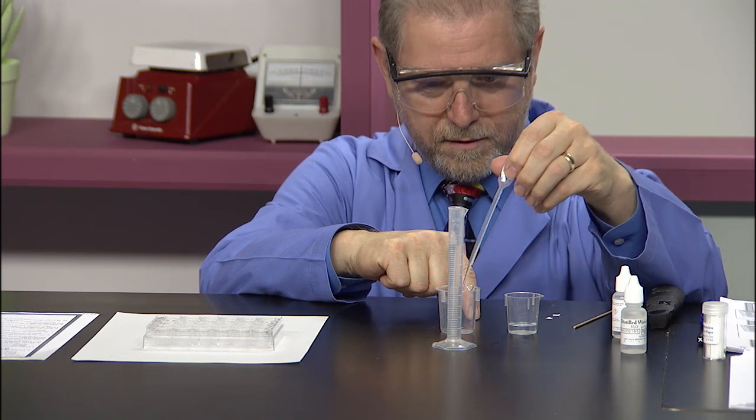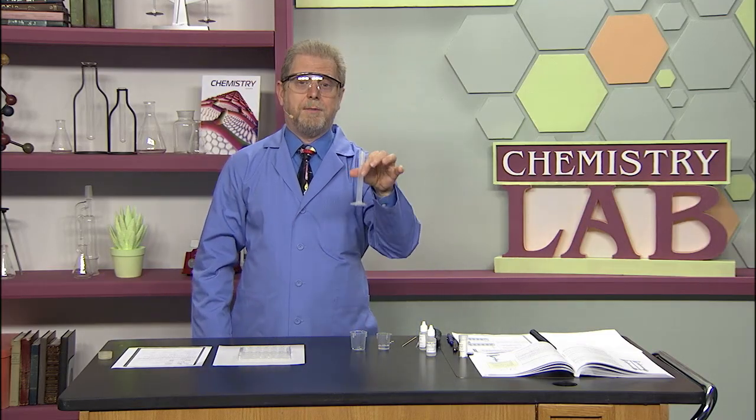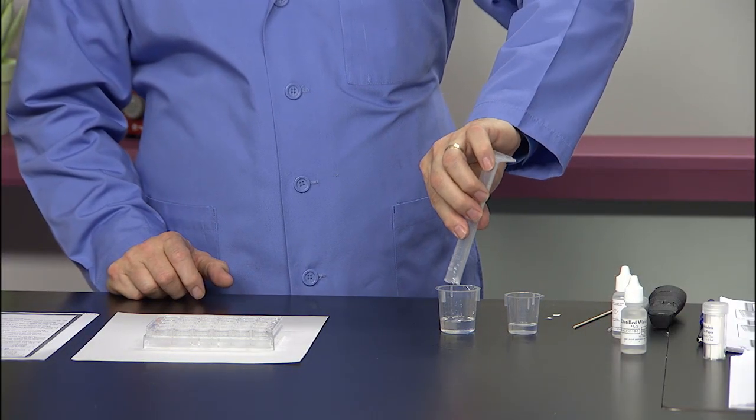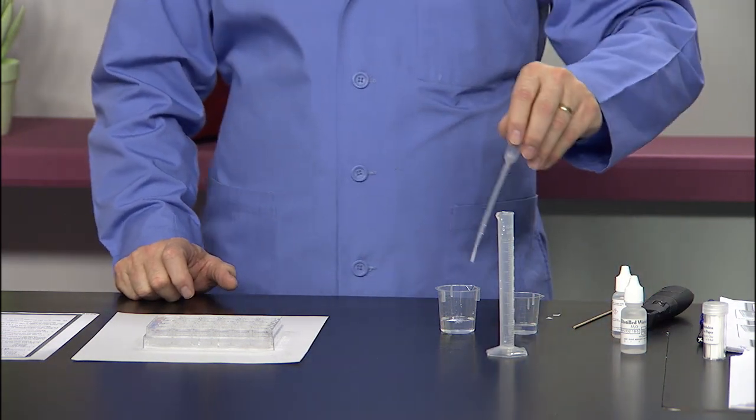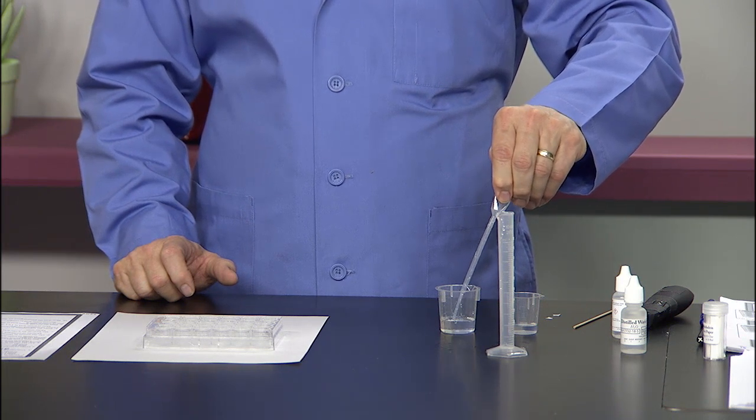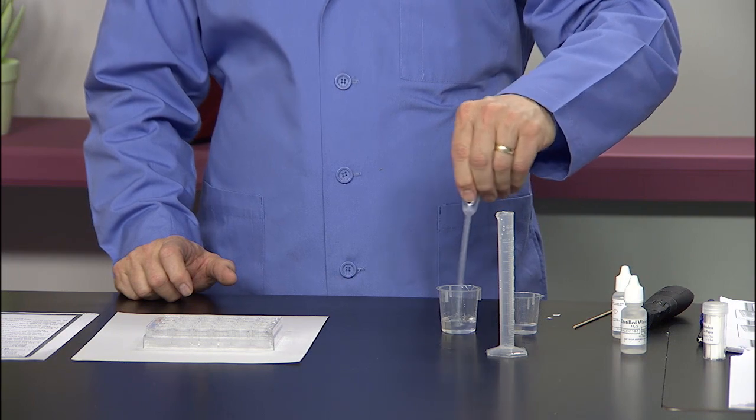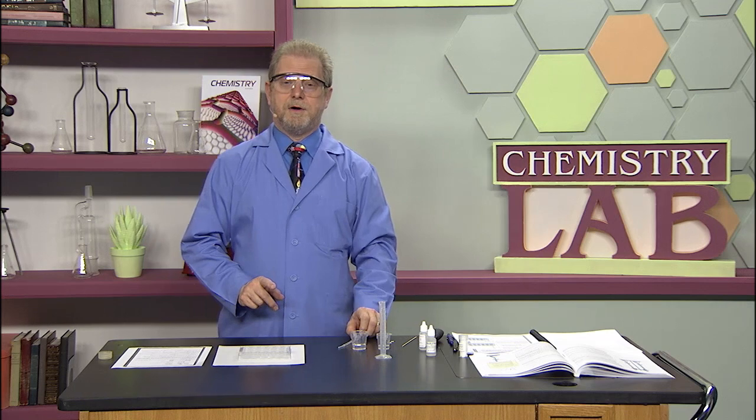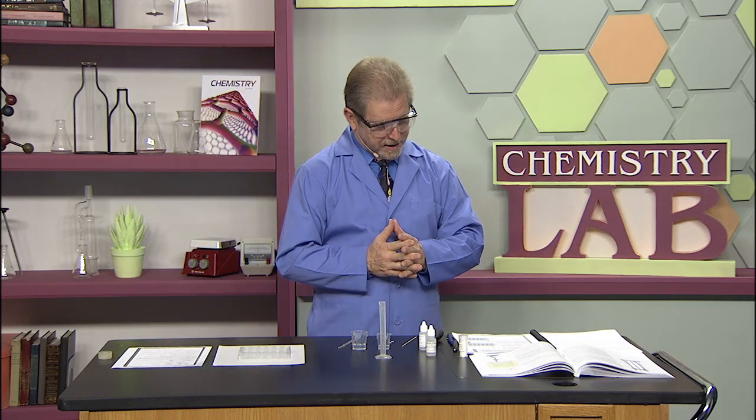I've measured nine milliliters of water and I'm going to add that. I'm going to take the disposable pipette, the calibrated pipette, and mix that around. We've diluted that by one to ten.